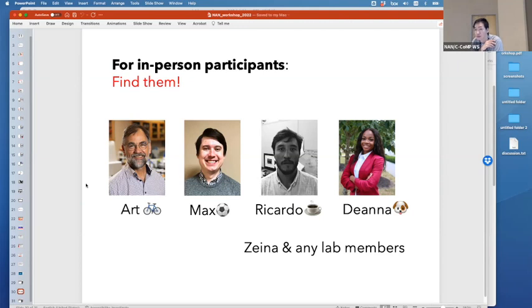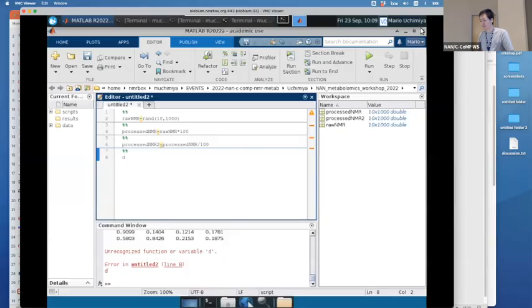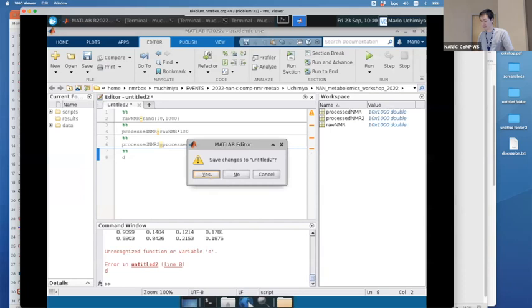And remember, when you start NMRbox, the screen resolution is generally low. You do that just so it will always work on whatever device. But one of the first things you're going to want to do is go up to the upper right corner, click the little NMRbox icon, go to screen resolution, and toy with changing the resolution.